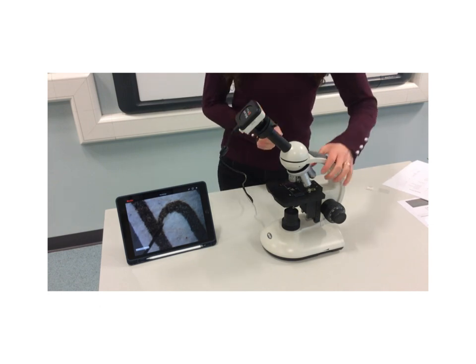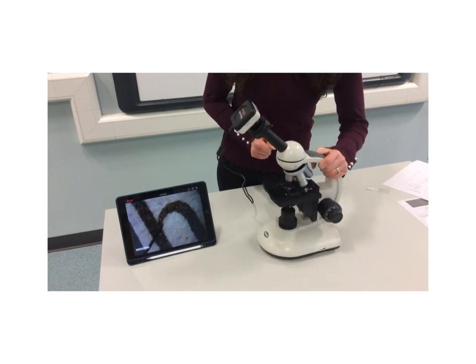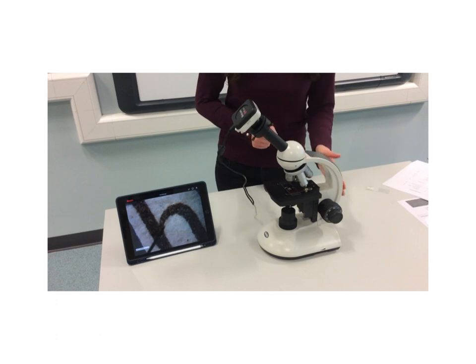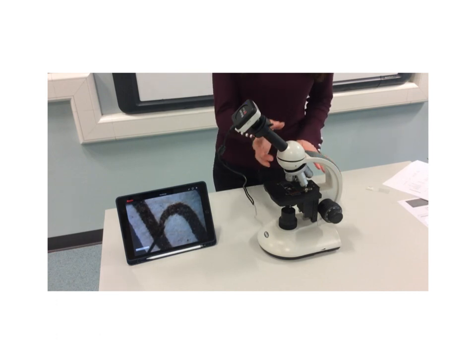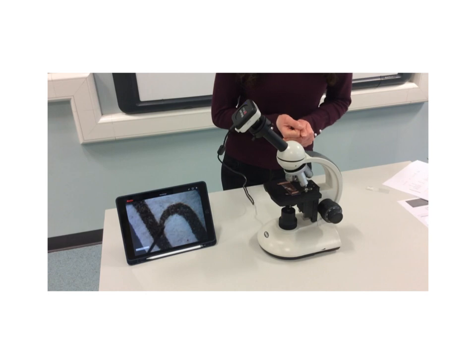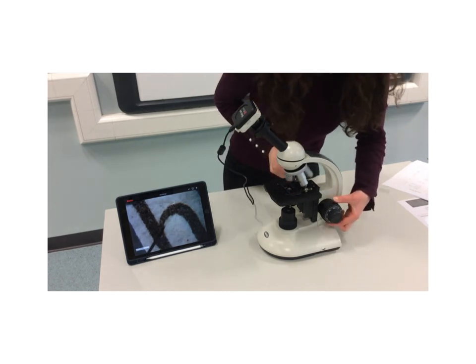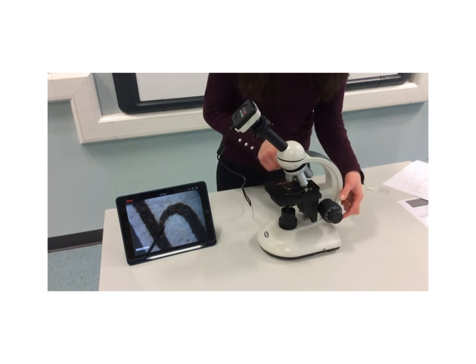Firstly, if you remember, we talked about how to hold the microscope. We hold it by the arm, or sometimes called the handle. That's this part here. It's important not to hold it by the lenses, particularly up here. It can be tempting to hold it by that, but that could break the microscope or cause a lot of damage to that. On the side here, our microscope looks a little bit different than the one in your notes.